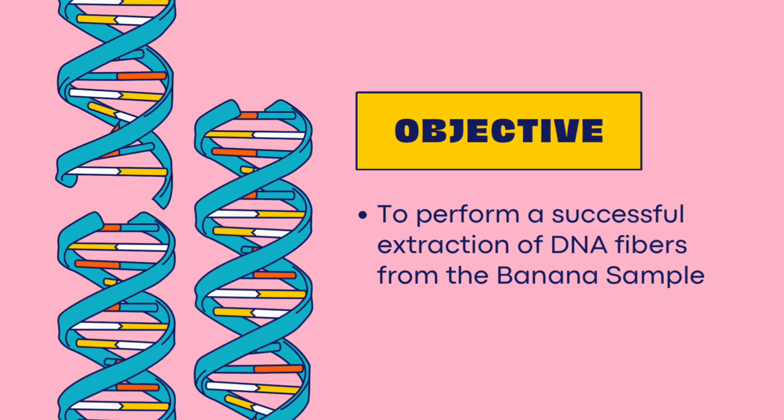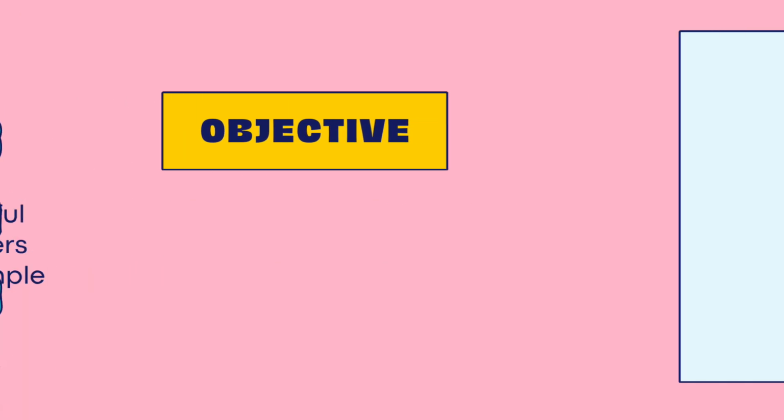Nucleic acids are more than just molecules. They are the foundation of life itself, dictating how organisms grow, develop, and sustain themselves. The experiment is also conducted so that we can study their genetic material and understand how their genes work. This process helps in areas like plant breeding, creating disease-resistant or drought-tolerant crops, and identifying plant species. It is also crucial for research like gene sequencing, genetic modification, and detecting pathogens to ensure crop health. Ultimately, DNA extraction allows us to explore the molecular blueprint of plants, advancing science, agriculture, and biotechnology.